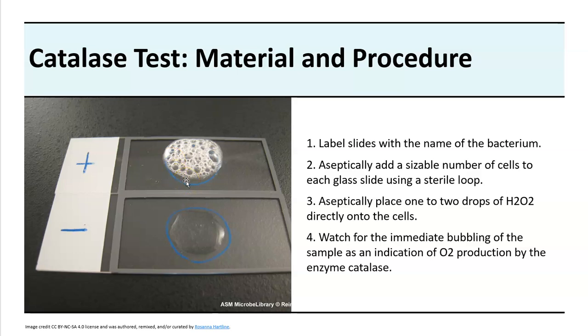What's happening here is the likely aerobic bacterium has released the catalase enzyme, and when it releases the catalase enzyme, that breaks down or neutralizes the hydrogen peroxide, which causes oxygen to be released, and that induces the bubbling that we see here.